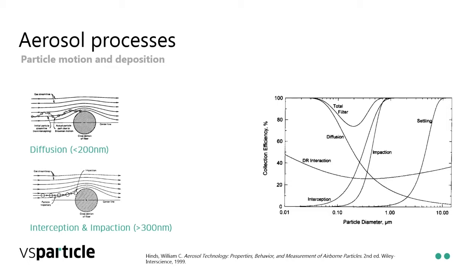And it is also what you will very effectively see if you try to work with anything below 20 nanometers: you will lose your particles to anything. The walls of your system that you're building, the tube walls or any obstructions that you have in there, quickly collect all particles. And so we need to figure out a way of reducing that available surface area.